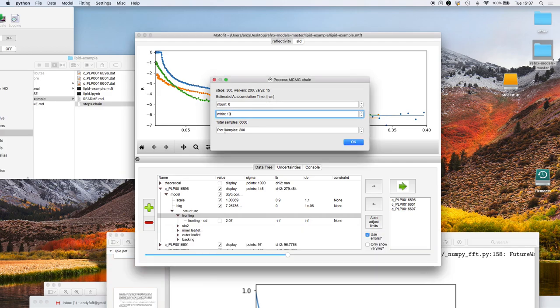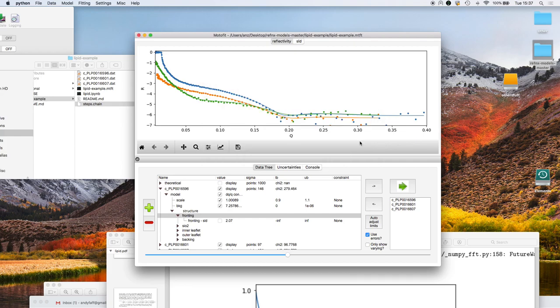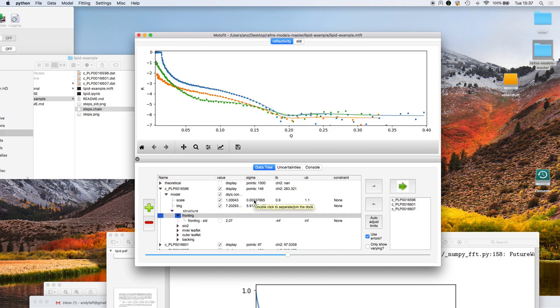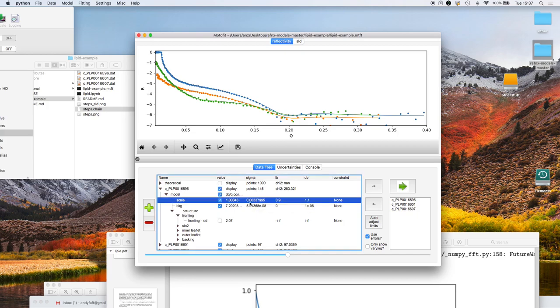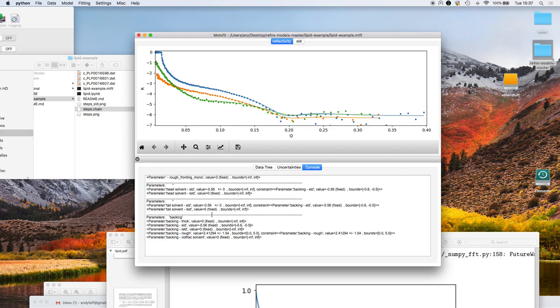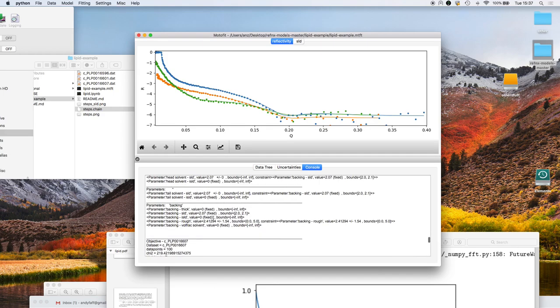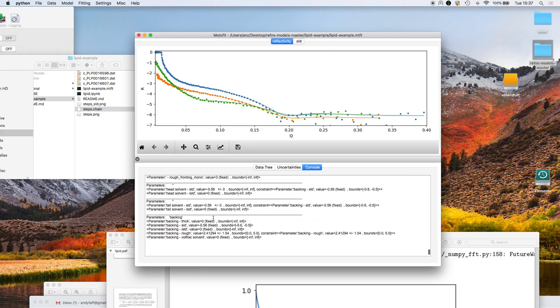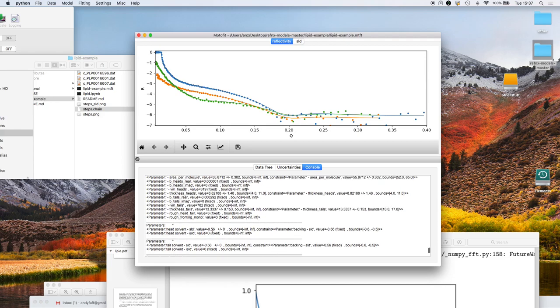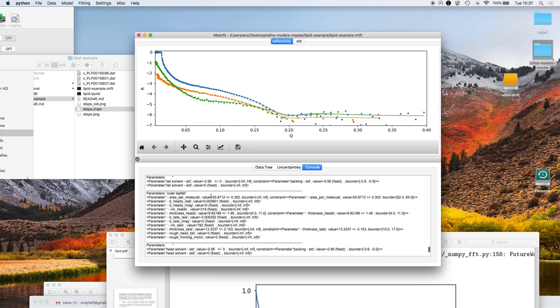Finally we can choose the number of plot samples and I'm just going to plot 200 here. So click on go and that's actually processed all the Markov chain Monte Carlo data. You see in the GUI we now get estimated sigma values for each of the parameters. In the console we get the parameter output for each of the Markov chain Monte Carlo sampling. So here the area per molecule is 55.8 plus minus 0.3.